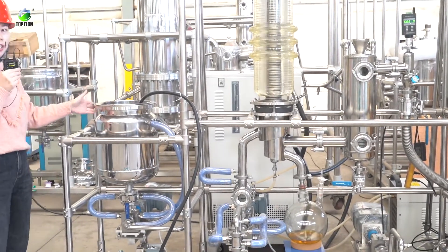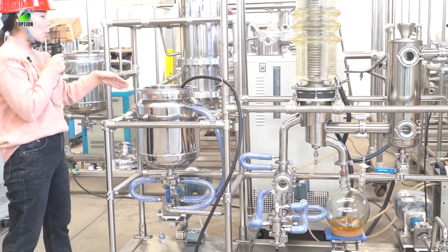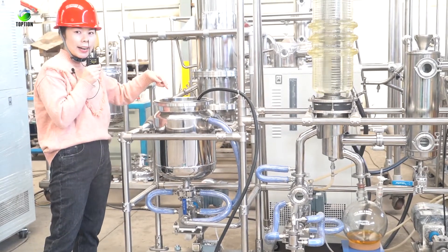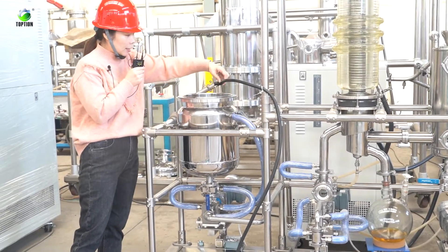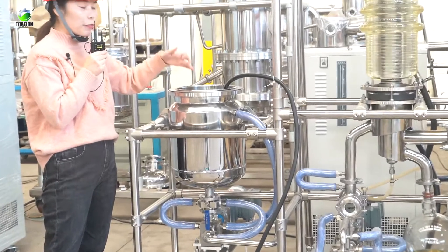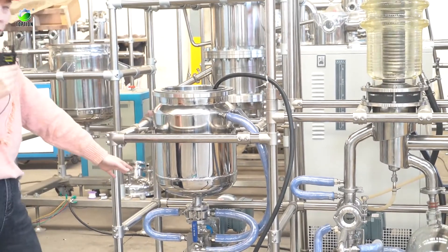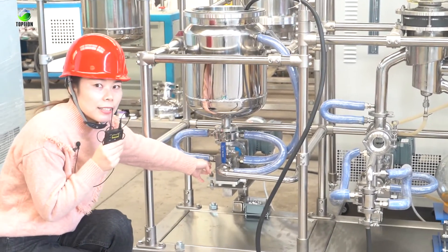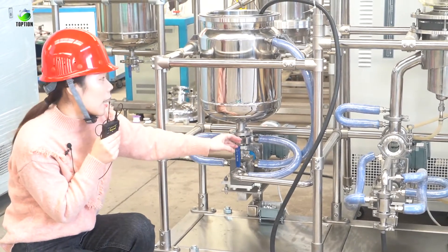On the left is the feeding tank. In this feeding tank you can put your material, and inside there is a filter net. You can see here — the oil will go inside after filtration. After this feeding tank, there is a gear pump here to control the flow of the feeding material.